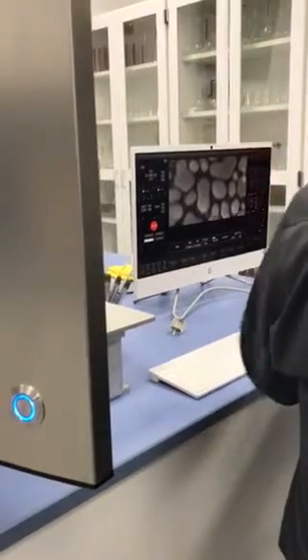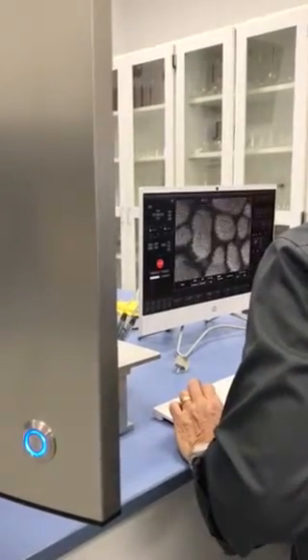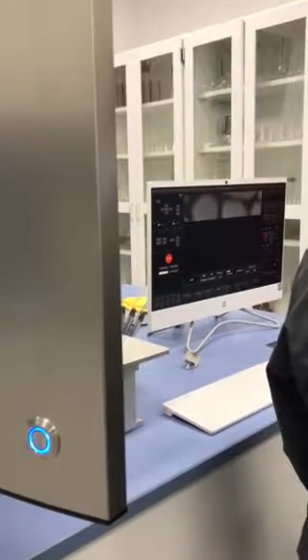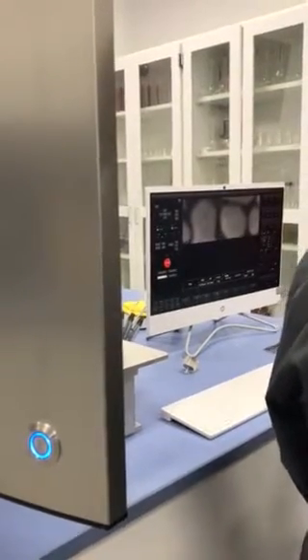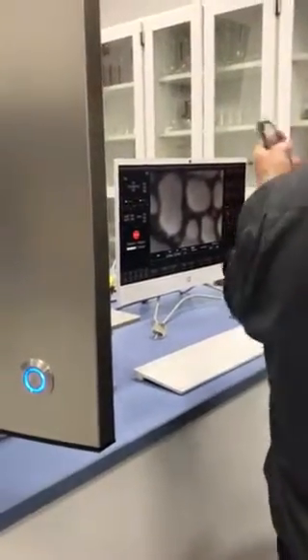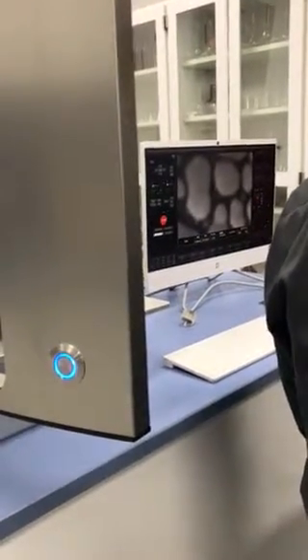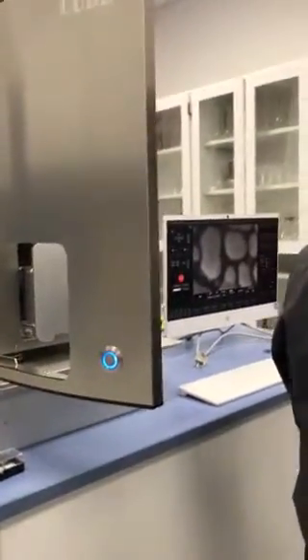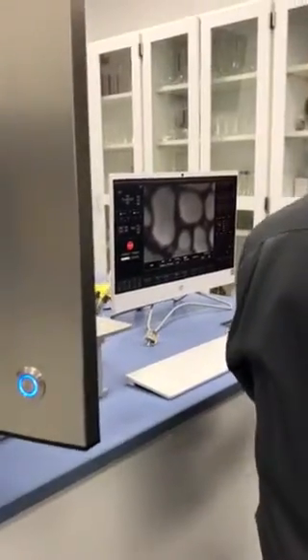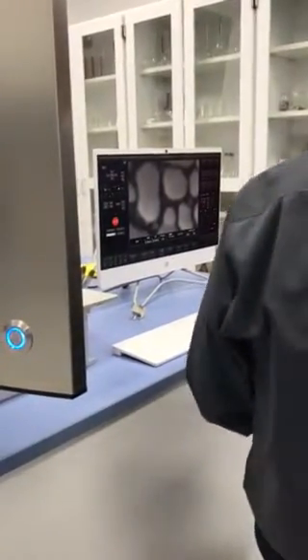This is a very big deal in the industry. At 247,000x — this is kind of what we were doing at the show, and people were amazed; one guy called who didn't believe we were actually running an SEM. Because usually this type of magnification, you would need a field emission microscope, which costs anywhere from $500,000 to $800,000 and is a huge monstrosity with three ion pumps in the gun. But we've got state-of-the-art technology in our column — a completely new design introduced at the show. We have a patent on the photomultiplier tube design and also a patent on the scan core design. There's nothing else from this small a package — you can pick this up and put it in your living room.